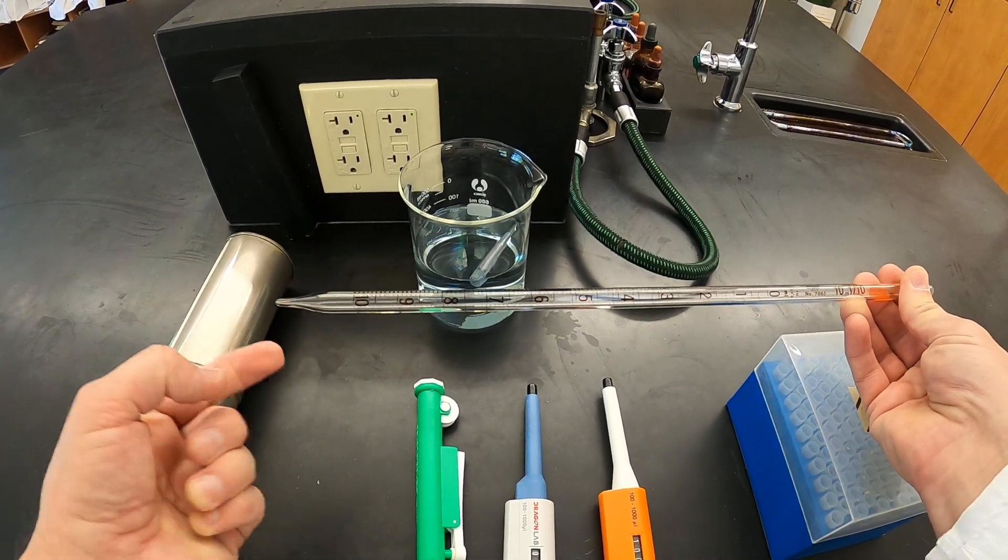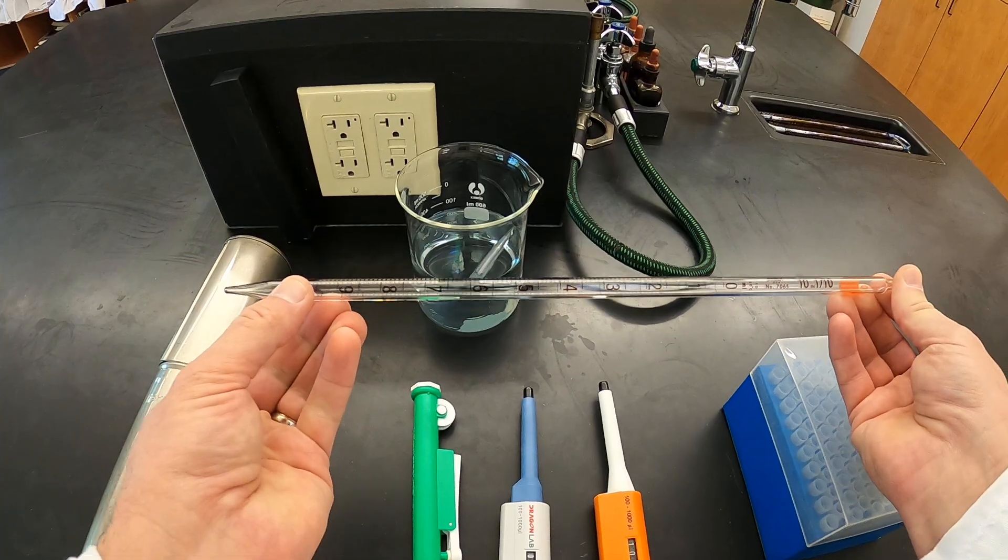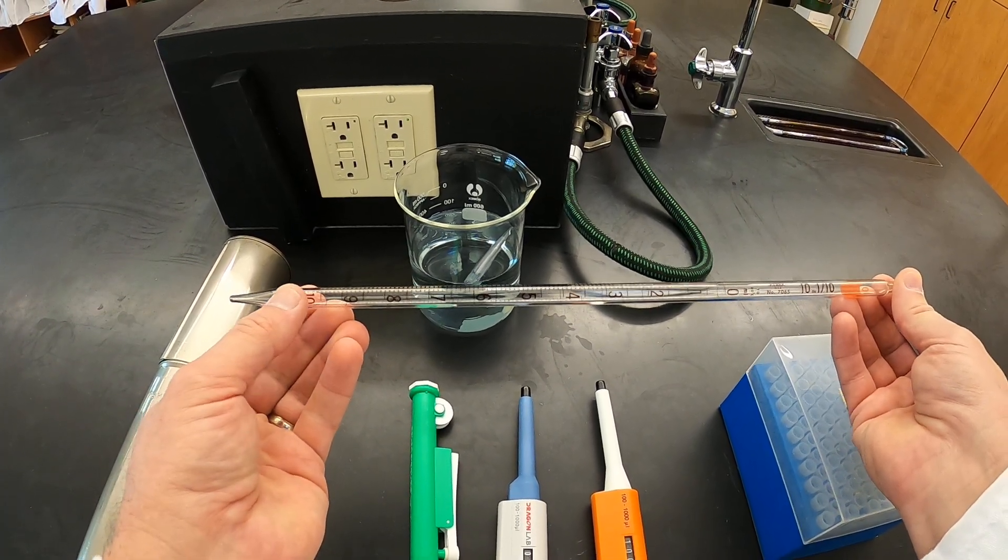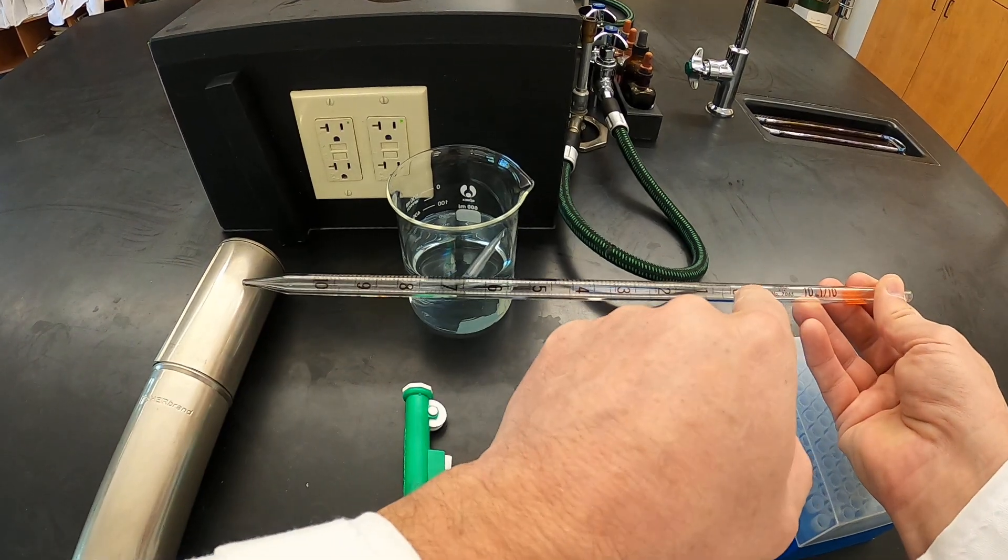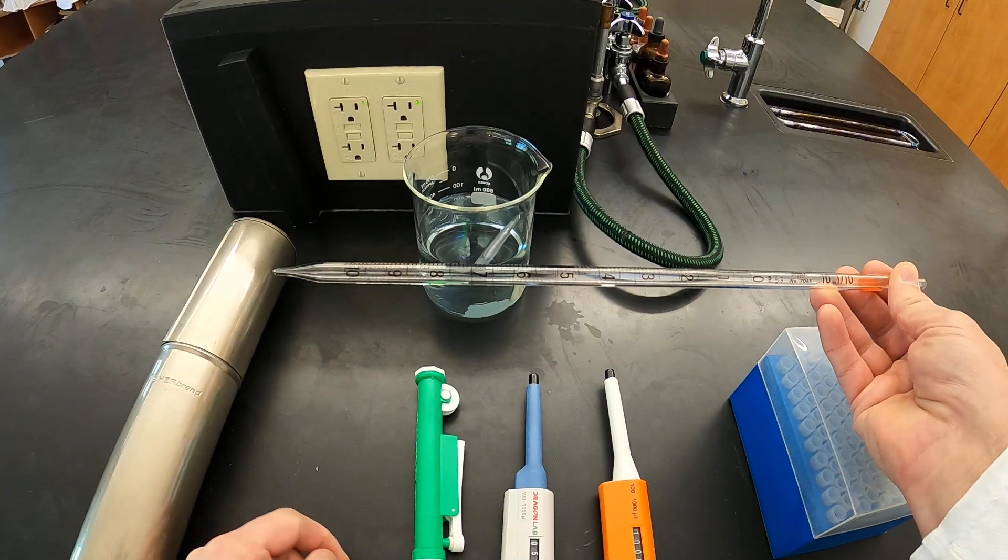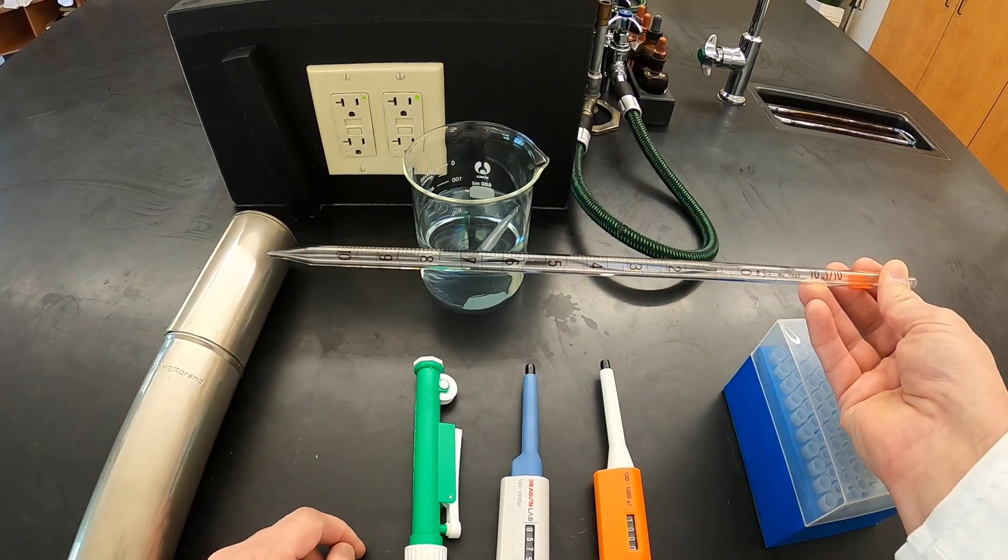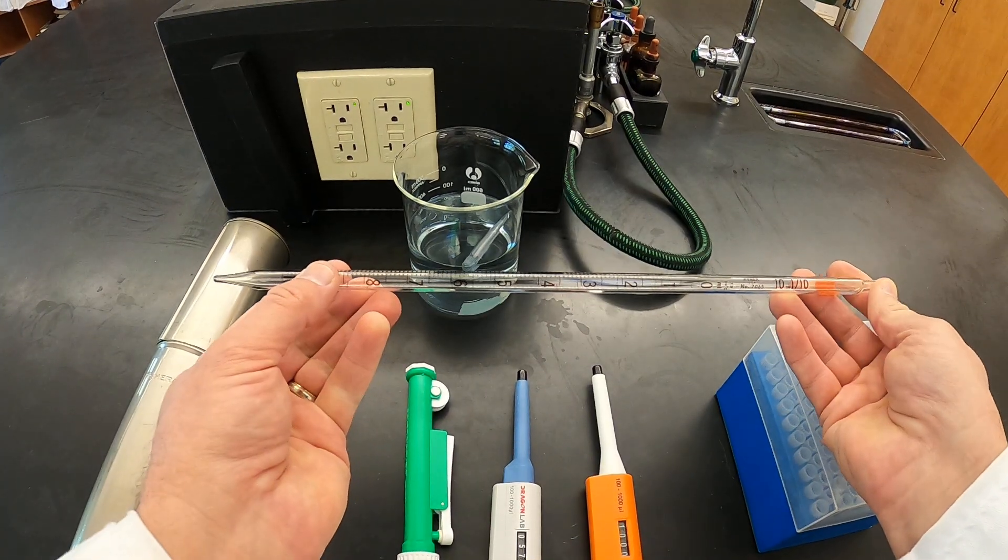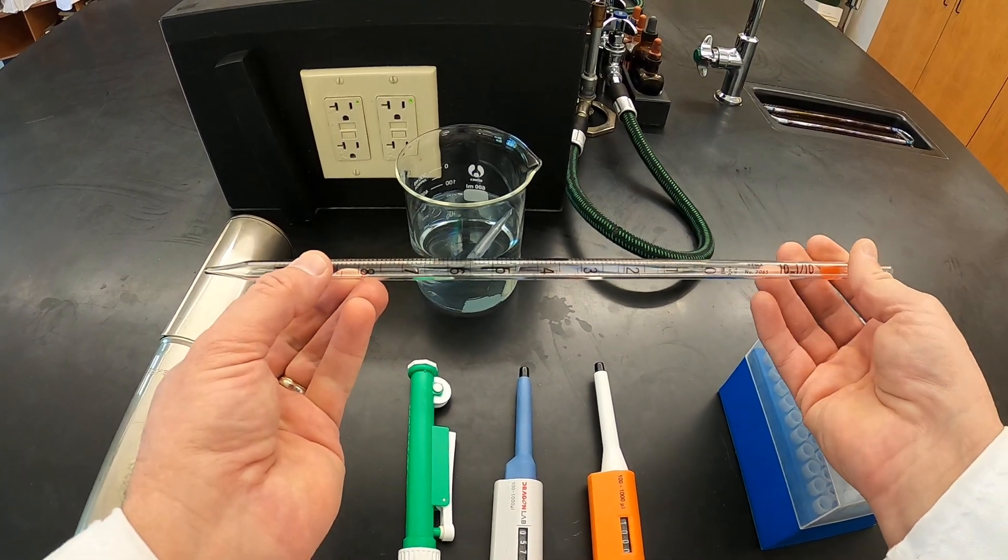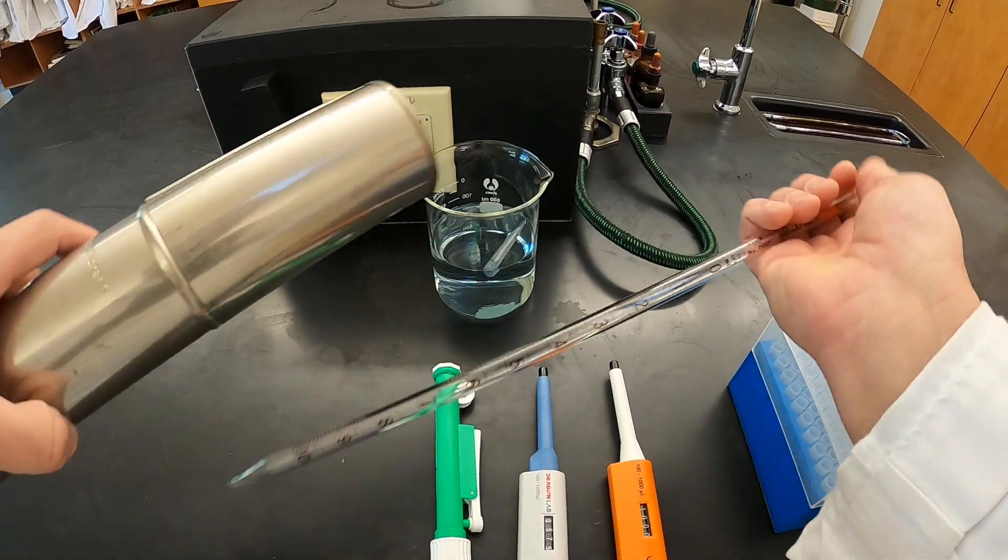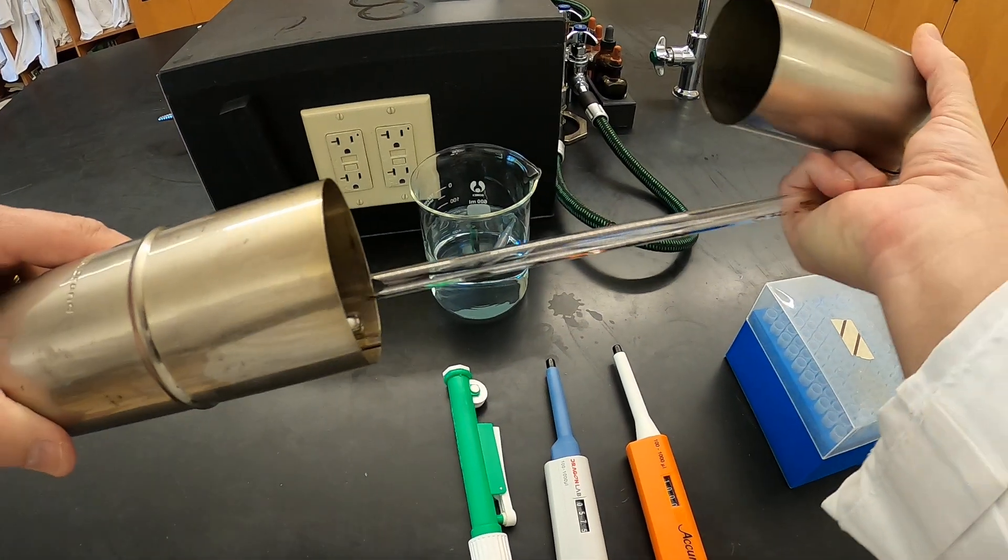So this is what is called a measuring or drain out pipette instead, because we are getting the volume from zero to 10 milliliters here. We are not ejecting liquid all the way out past the end in order to get the desired volume. So I'll show you how to practice with each of these. Again you can notice the increments going from zero to 10 here.